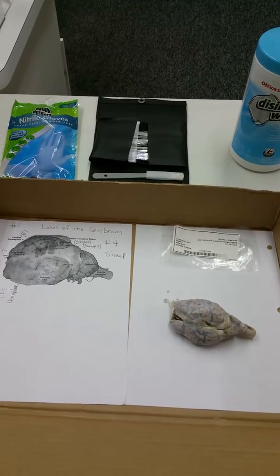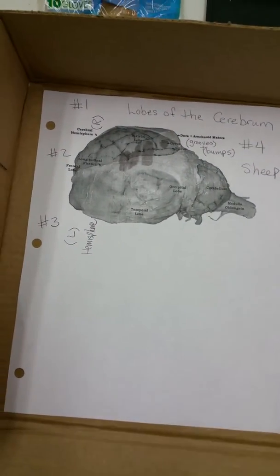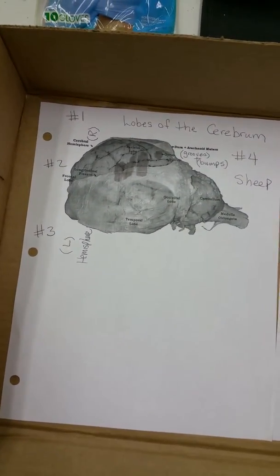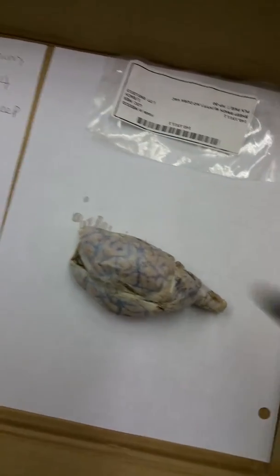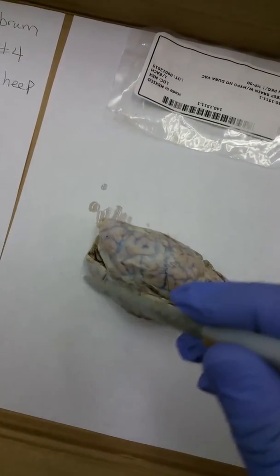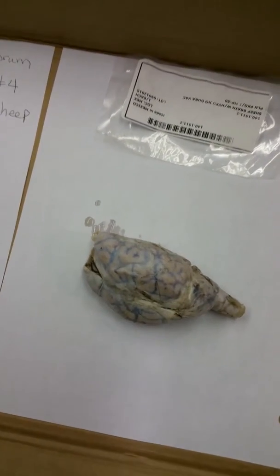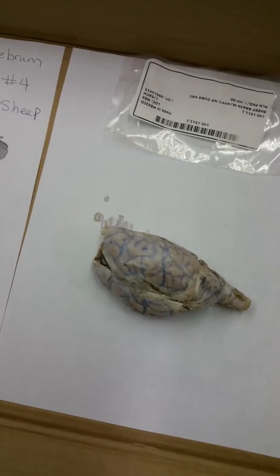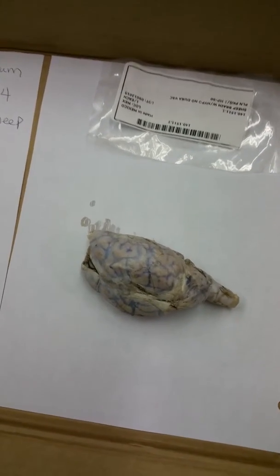We want to look at what the left and the right hemispheres are. If we go back to the picture, we are able to see that it is labeled appropriately, and then we're going to come to the real brain and look, by using my scalpel as a guide, at the right hemisphere and the left hemisphere. As you can see, the sheep brain does not lay flat on the surface, and later on we'll be able to dissect and also create the sagittal view.